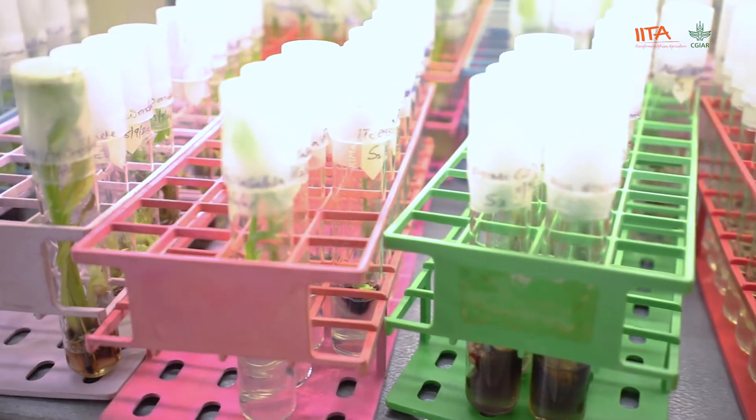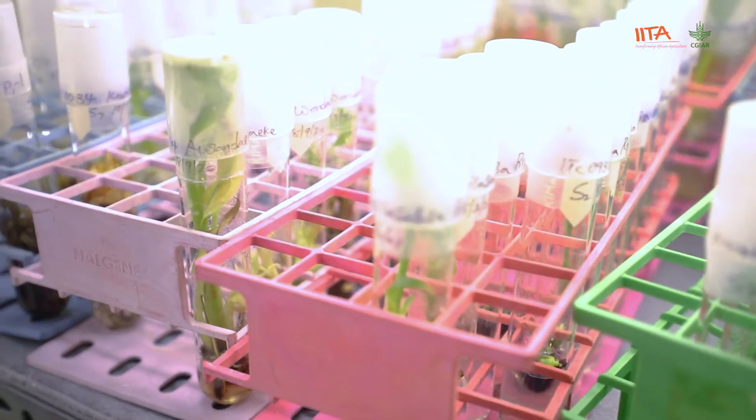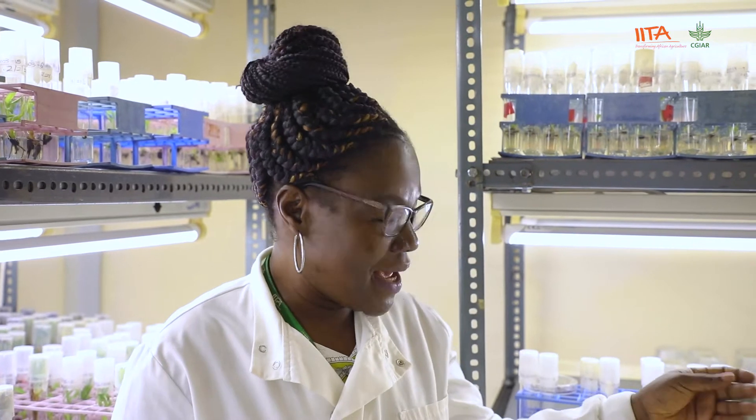When we produce rooted plants in tissue culture, we normally take them out for acclimatization or weaning in the screen house. Another method for producing large numbers of planting material is macro propagation, which is simpler than tissue culture. I'm going to take you now to the macro propagation facility to show you how that is done, after which I'll take you to the screen house to show you how plants from both methods are acclimatized so that they are ready.